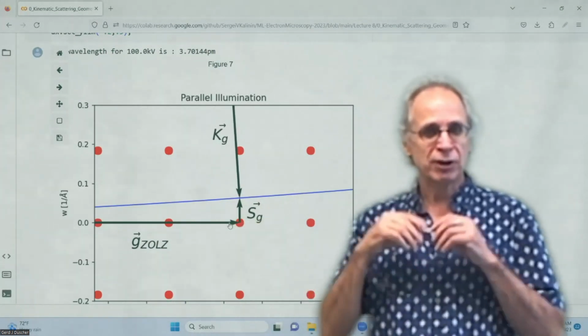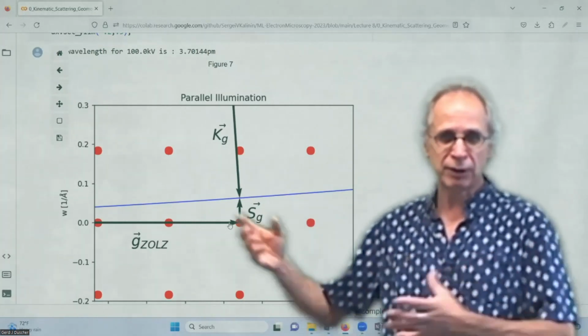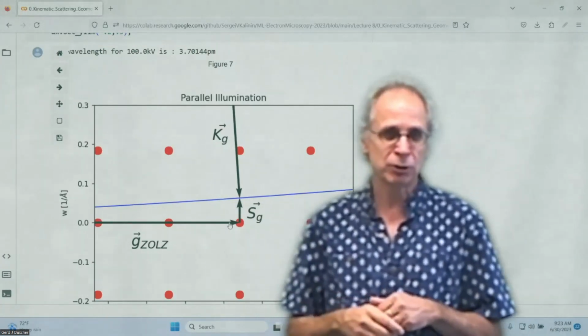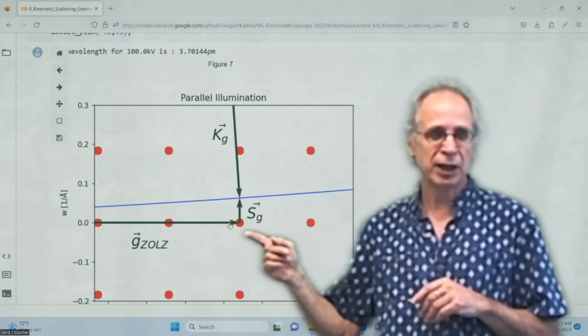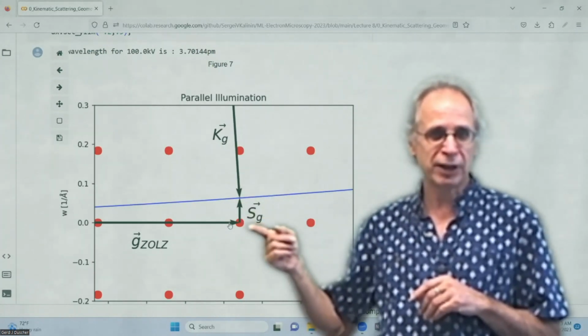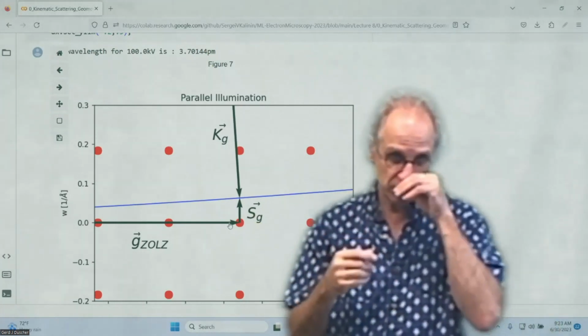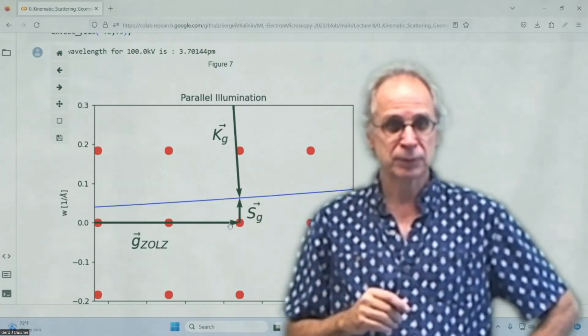Okay. The dynamic diffraction, so it means double diffraction, so the shifting backwards and forward of intensity, the shape, everything is going to be in what this spot here exactly looks like in 3 dimensions. And it will be a relatively complicated figure.